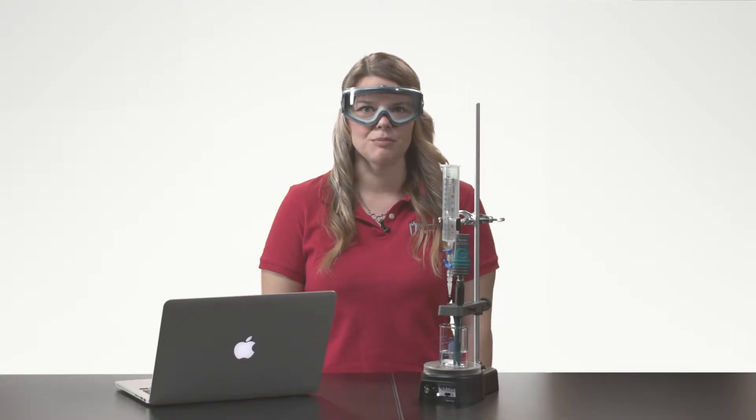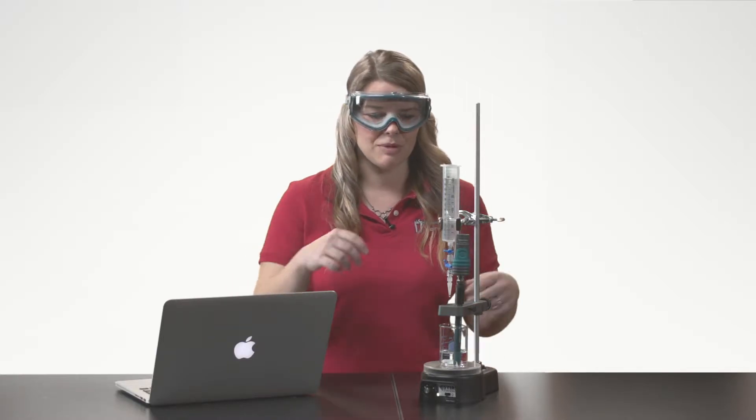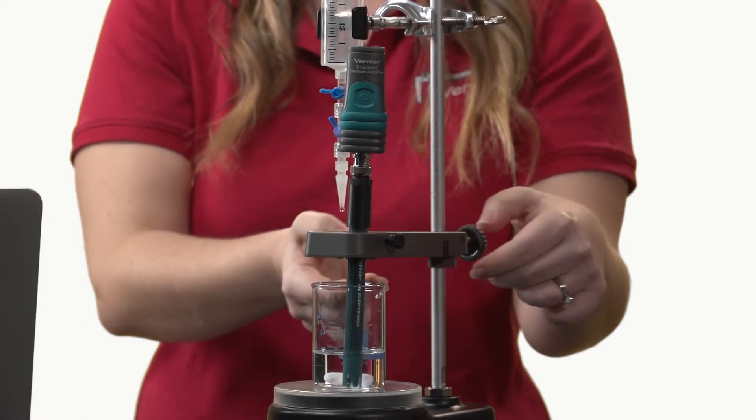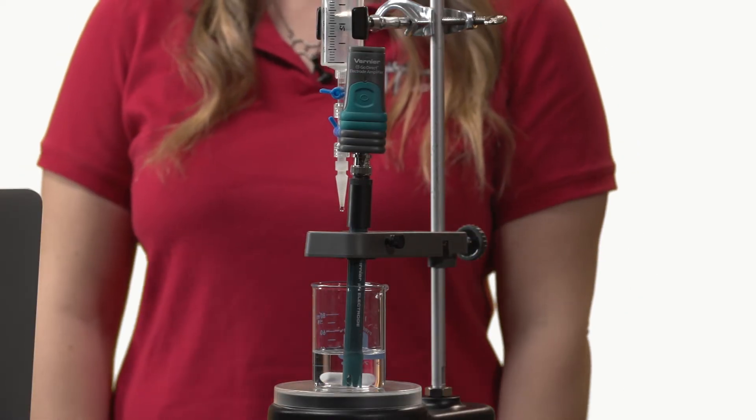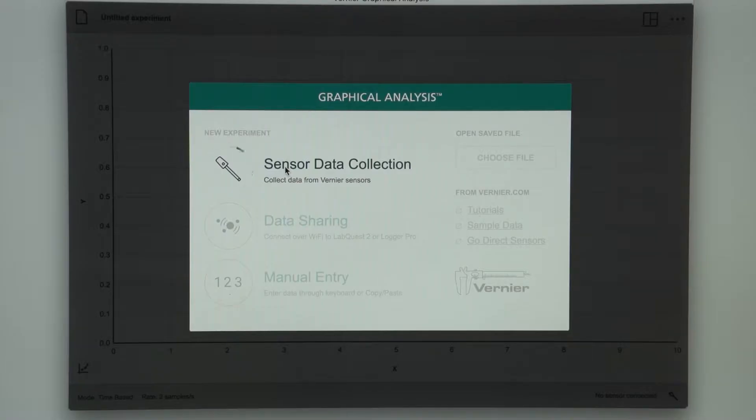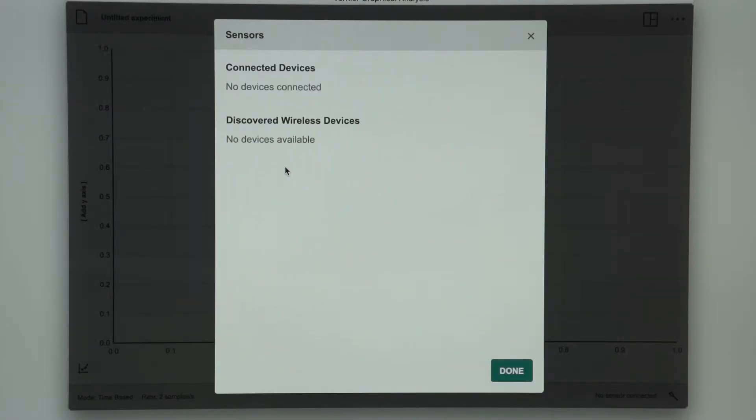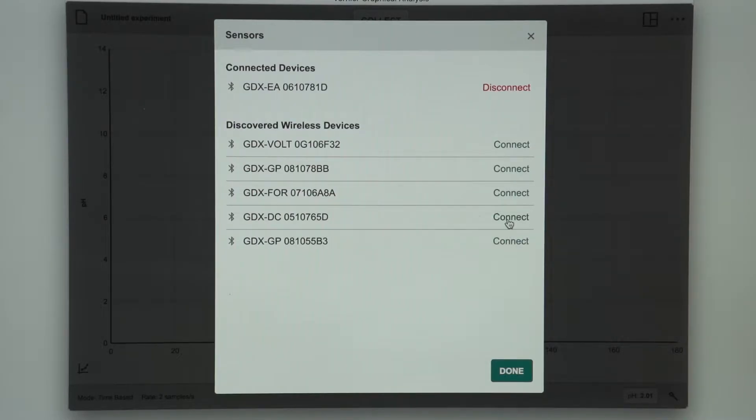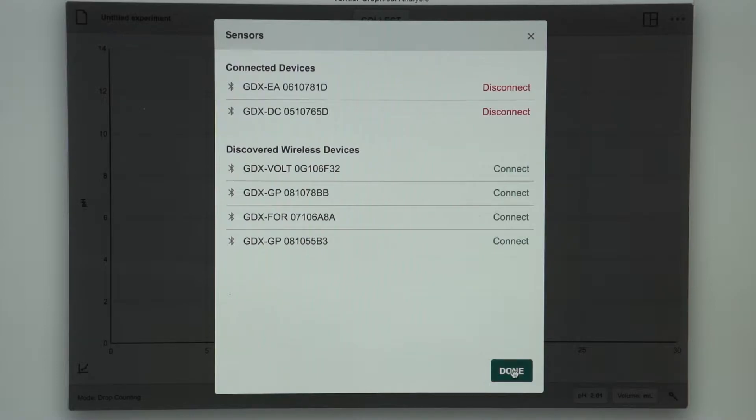Since I will be taking data via Bluetooth, I will now turn on my pH probe and drop counter. I'll then launch the GA4 app and select sensor data collection. I'll then connect to my pH probe and to my drop counter. Select done.